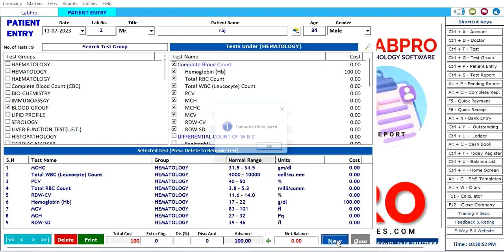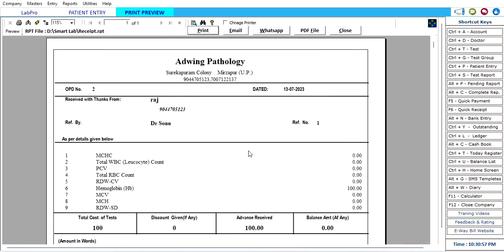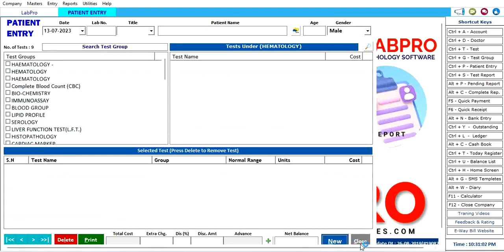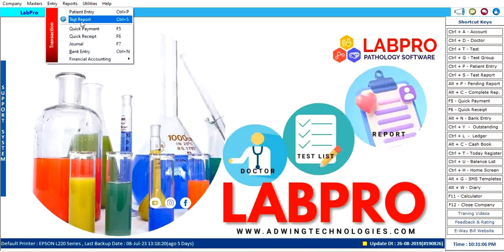Your receipt is automatically designed and you can take a printout over here. Just print it here. If you see the latest report, there's pending reports and complete reports.